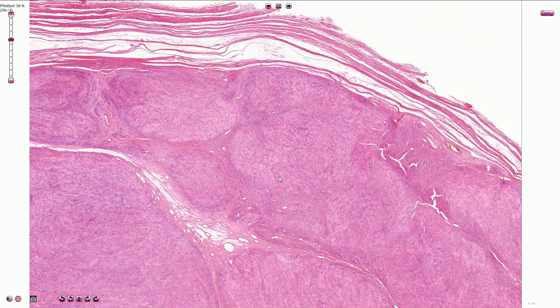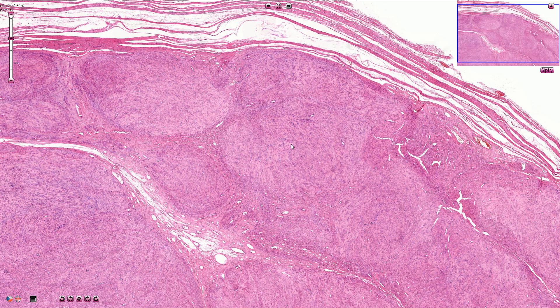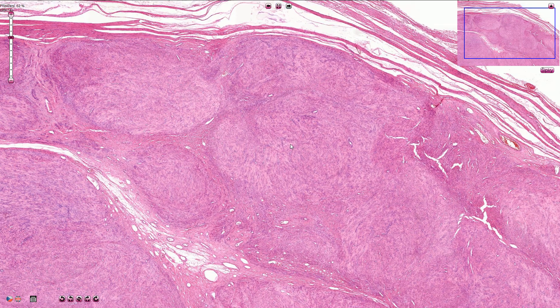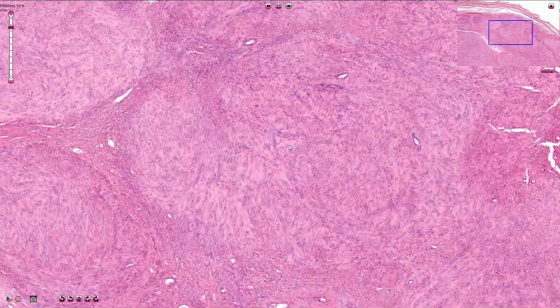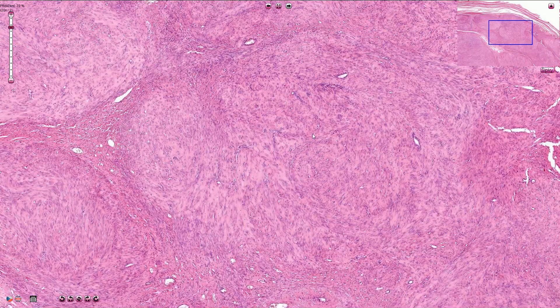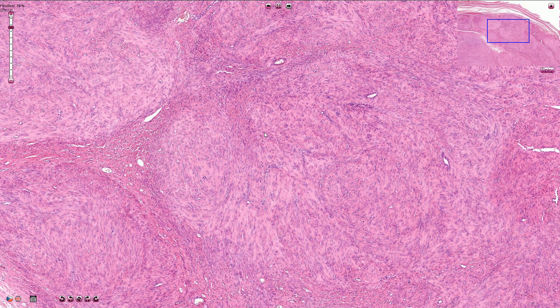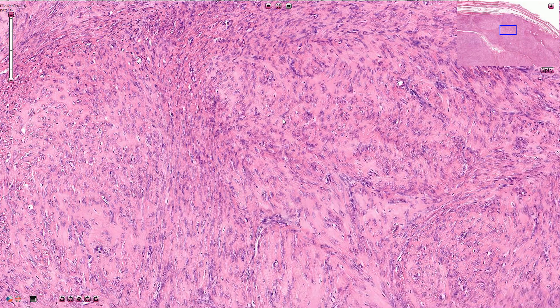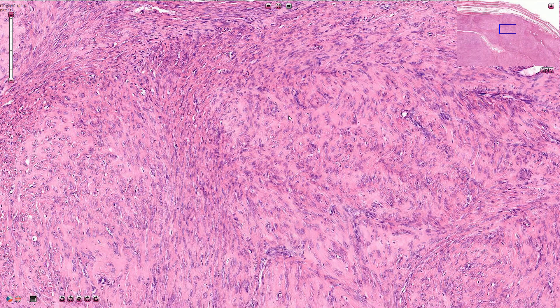Under the microscope we can see a fascicular tumor composed of spindle-shaped cells. Sometimes it can be associated with nodular patterns, and sometimes we can see whorled structures. On higher magnification we can see the smooth muscle cells with elongated spindle-shaped nuclei.